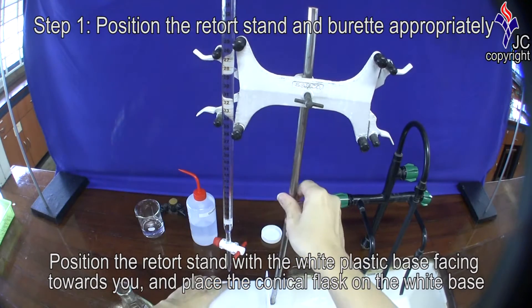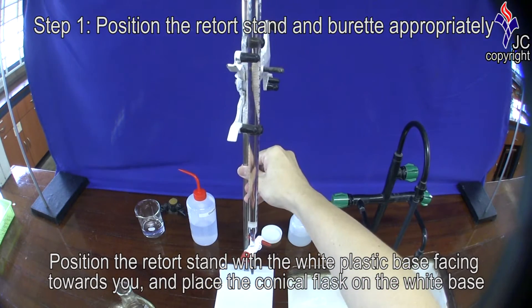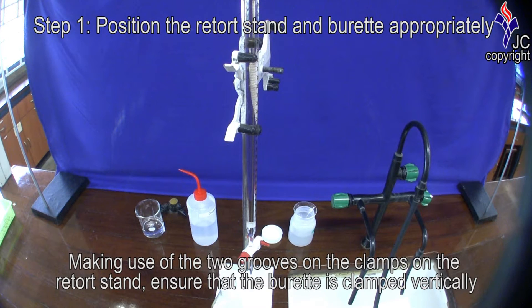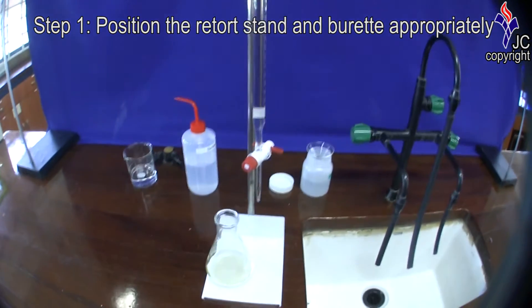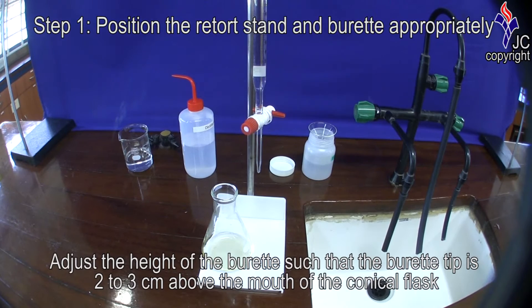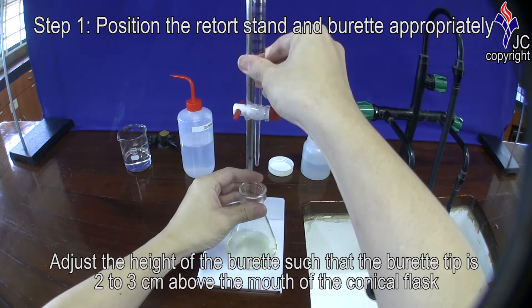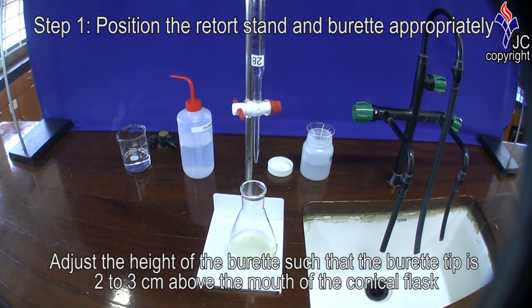Position the retort stand with the white plastic base facing towards you and place the conical flask on the white base. Making use of the two grooves on the clamps on the retort stand, ensure that the burette is clamped vertically. Adjust the height of the burette such that the burette tip is 2-3 cm above the mouth of the conical flask.